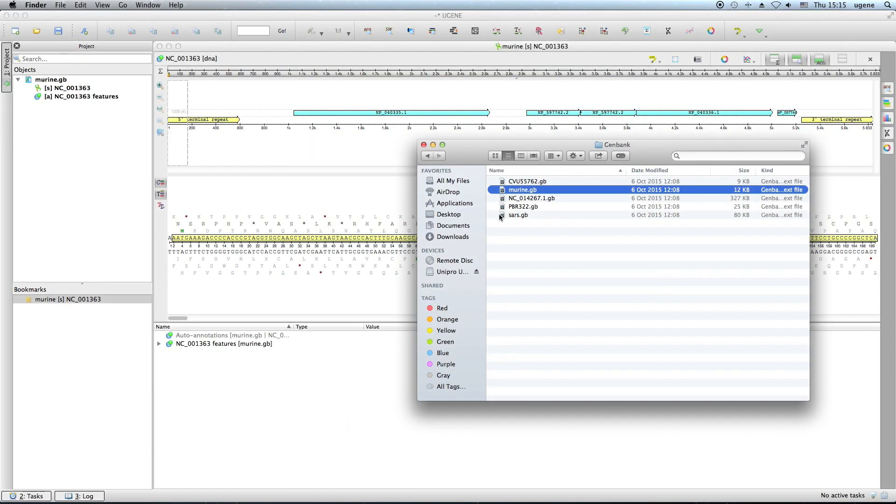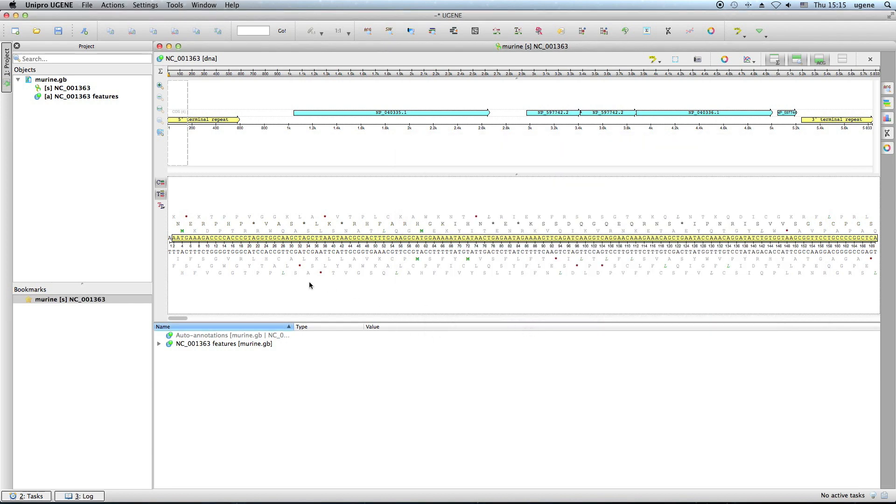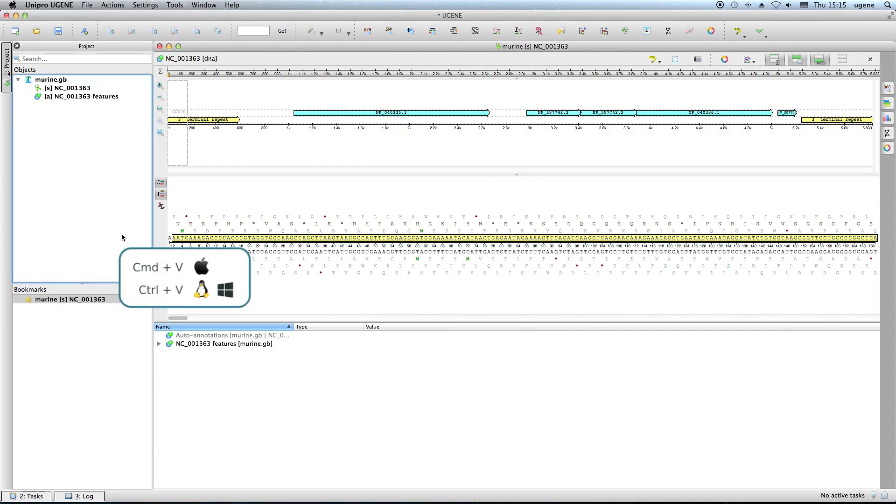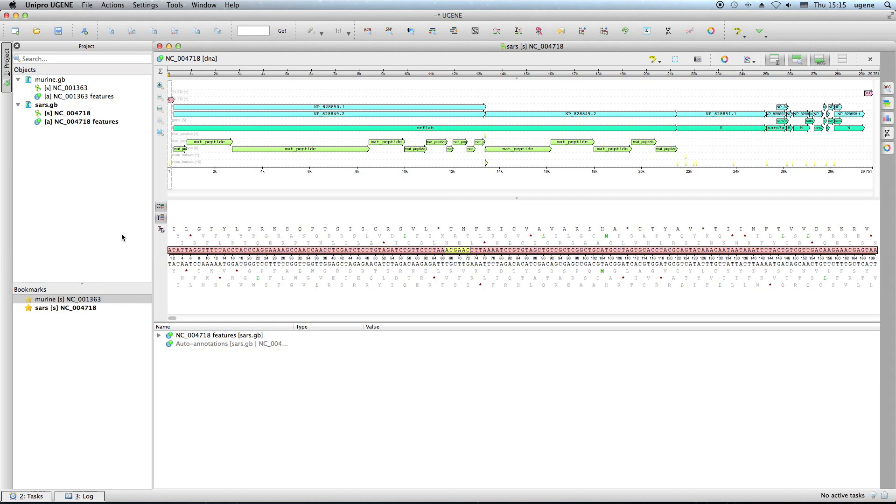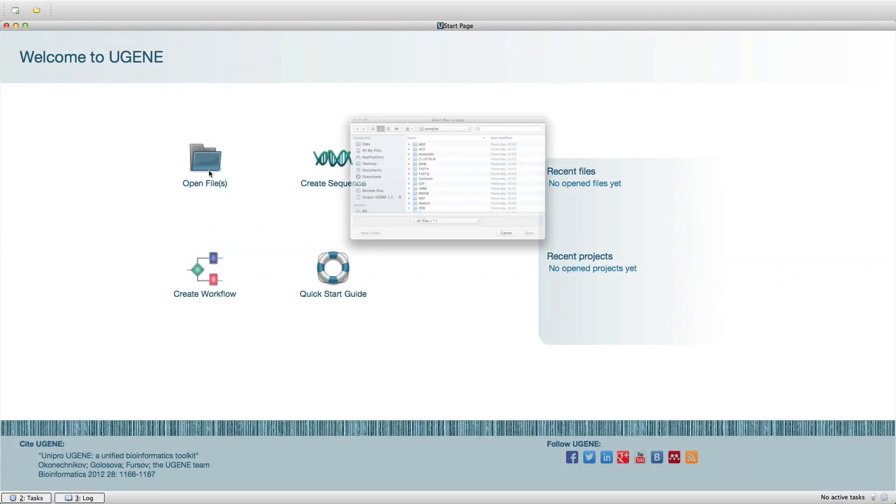In the previous podcast we introduced pasting of data into a project. Now you can simply copy and paste data from and into a sequence or an alignment. Let's check this out.